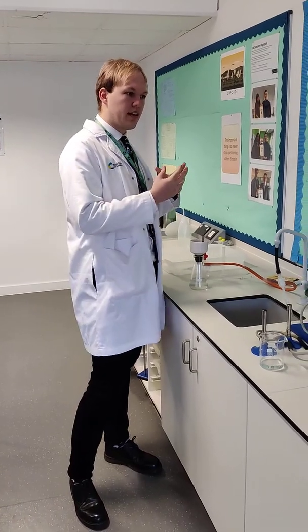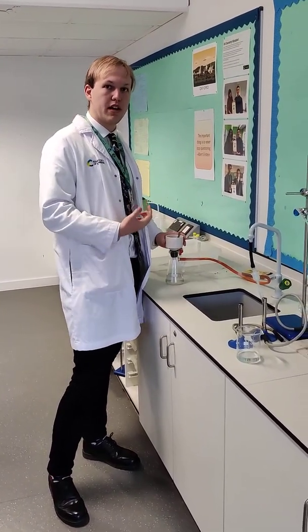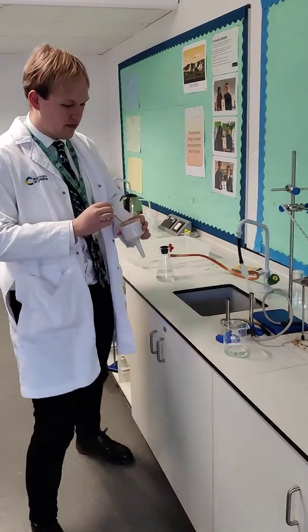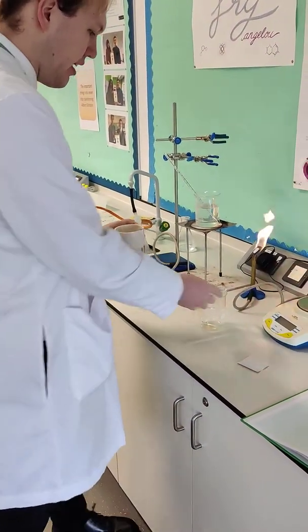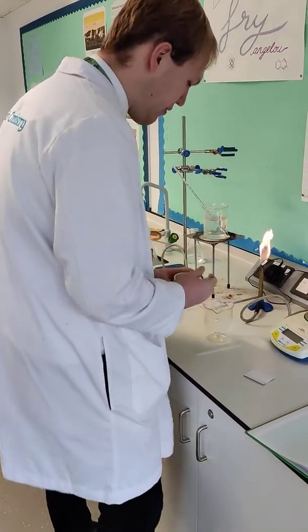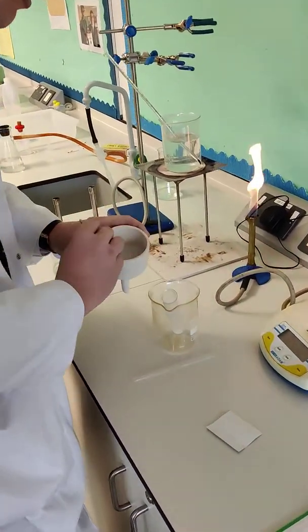We want to end up with the pure aspirin product, and to do this we're going to use a method of purification called recrystallisation. The first step is to take our crude product and place it in 25cm³ of ethanol. We're going to carefully place it in here, and it won't start to dissolve yet.